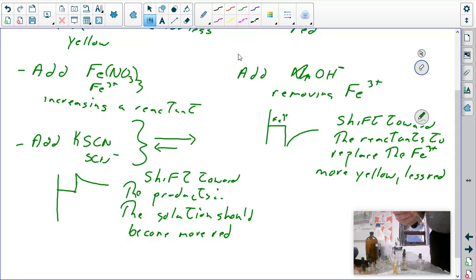I guess maybe, when I'm imposing the results that I expect upon the actual results, I saw a bit more red in this when it was next to the red thing. So again, we have two inconclusive results with this experiment.